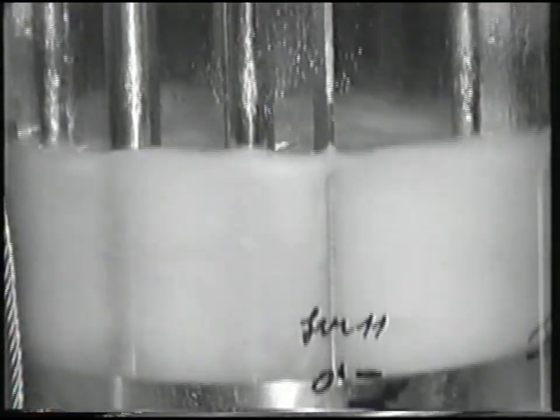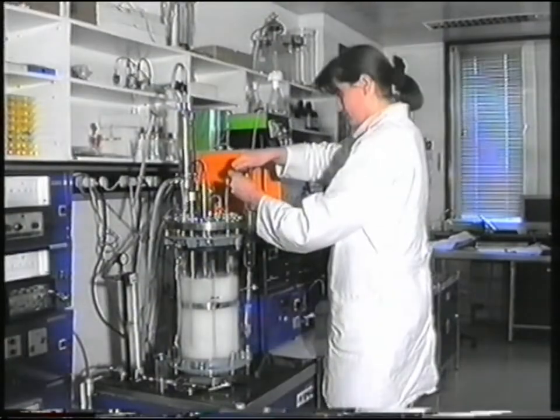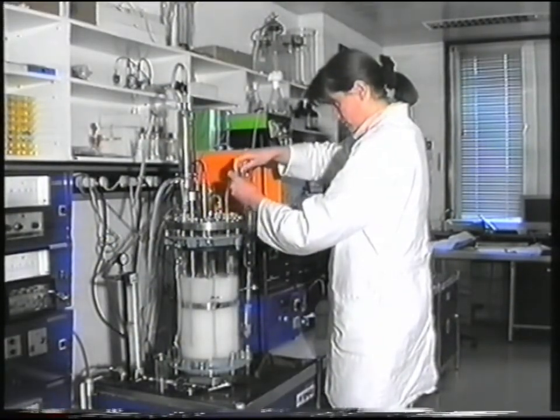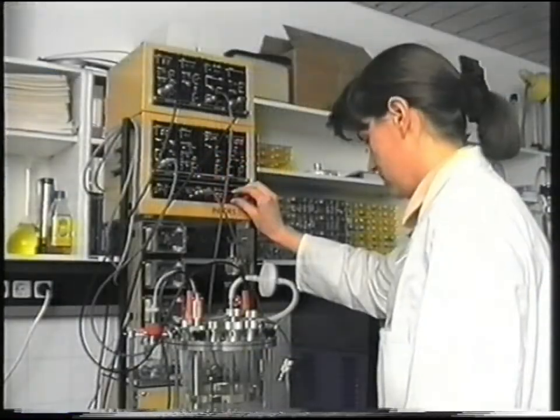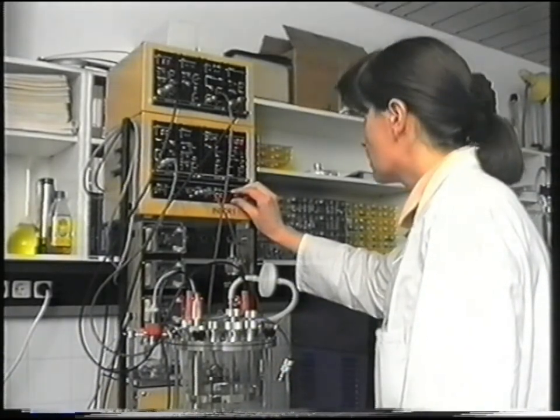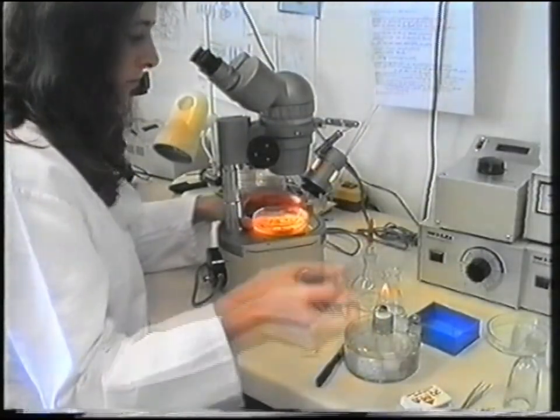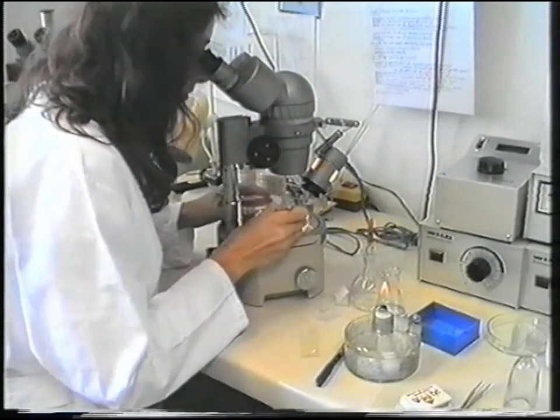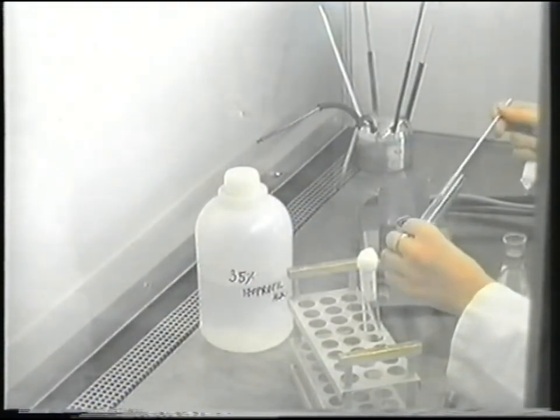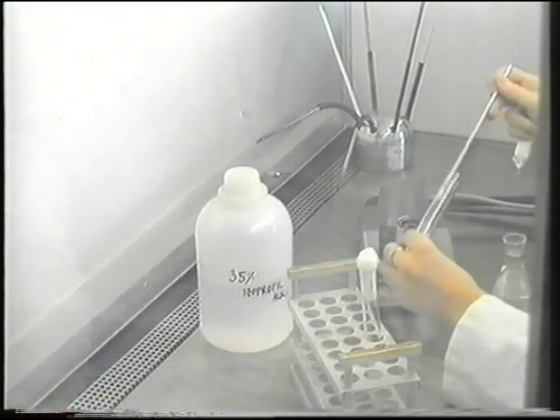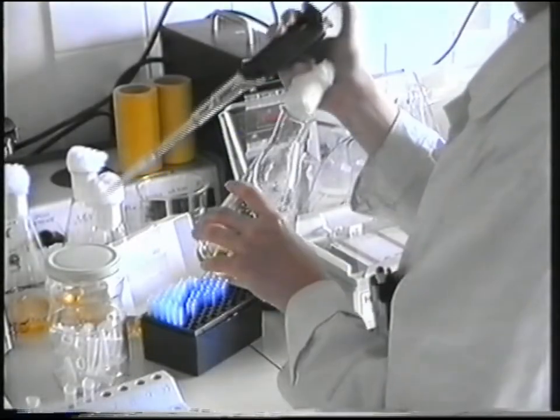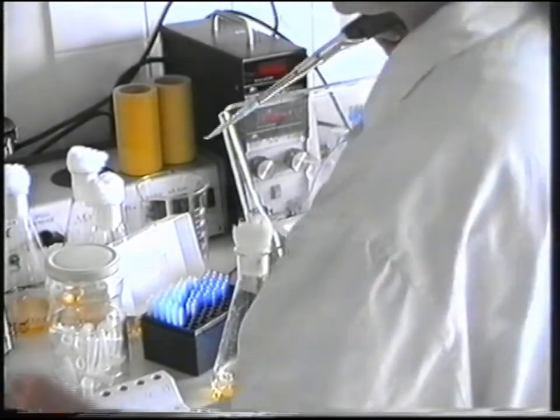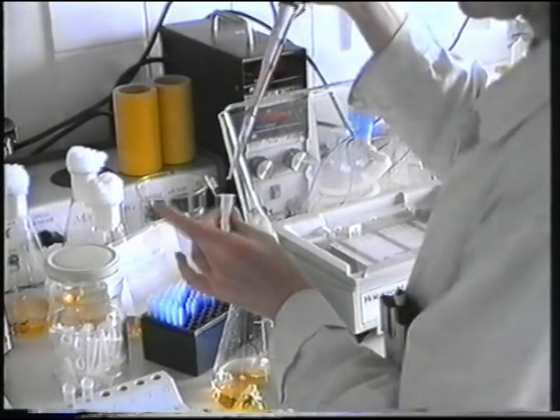At the department, research is focused on the use of microorganisms, mainly fungi. Under defined conditions, fungi are able to excrete a number of useful bioproducts, such as enzymes, organic acids, antibiotics and other pharmaceuticals and recombinant proteins. We are equipped with laboratory bioreactors and with fermenters, where the growth of microorganisms and the accumulation of products can be adequately monitored.